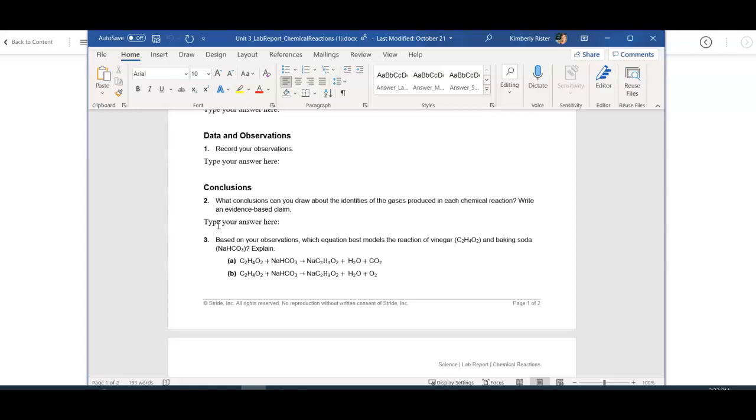What we should have been able to see is that we know carbon dioxide gas is produced when things bubble like that. And so carbon dioxide was produced in those chemical reactions because the lit match went out when it's placed in the container, right? So that's how we were able to tell. Now, hydrogen, again, in that video, it's there and it's a factor. I think that's an error in the lesson. So scratch hydrogen being in there altogether. And then your conclusion, you're just writing that and then making sure you have evidence there.